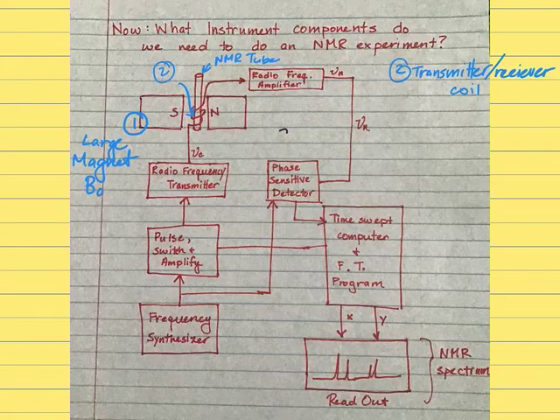All right, the next component that we have is part 3, which is the frequency synthesizer. Down here, the frequency synthesizer. This generates radio frequency electromagnetic radiation.